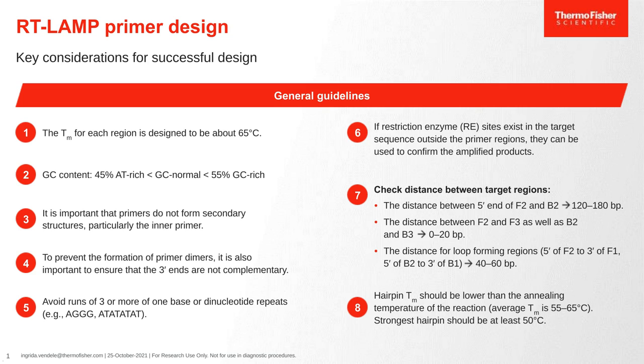In such a case, you would see a single band on the gel instead of a signature LAMP ladder-like pattern. Check distances between target regions as provided here, and also monitor hairpin melting temperature.